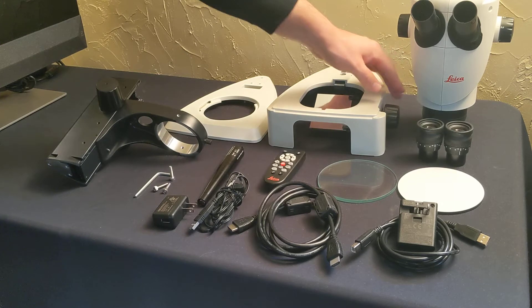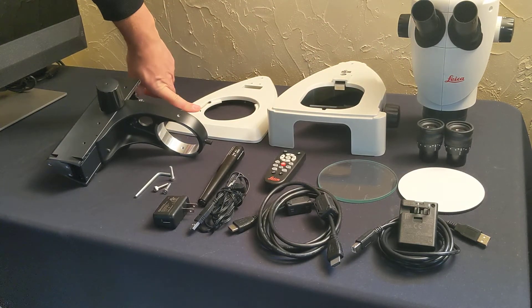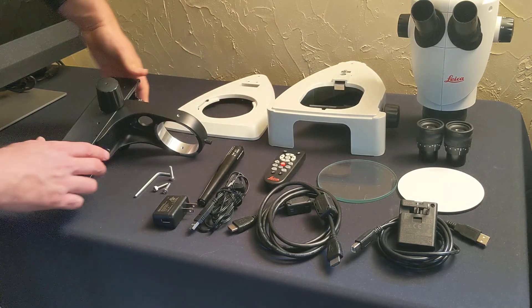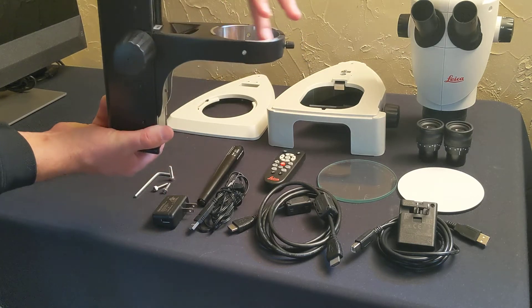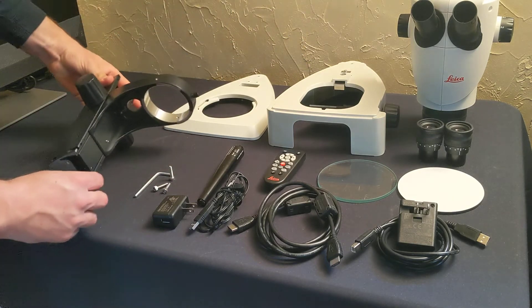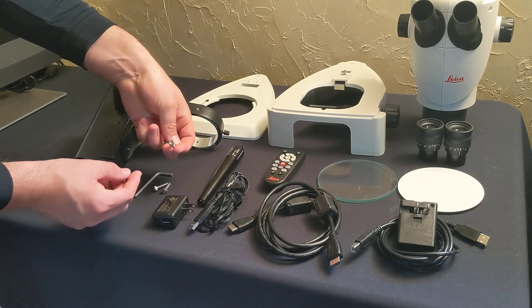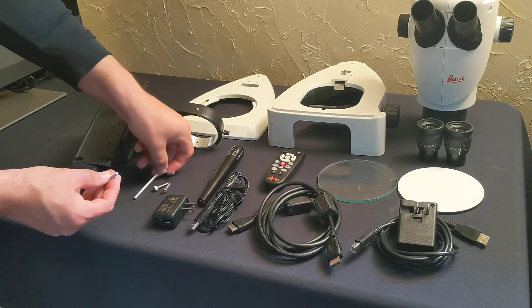And the incident light base that goes on top of that eventually. And then lastly, the focus column with the microscope carrier. In the column box there's a baggie that has three screws and the tool — the only tool that you're going to need.